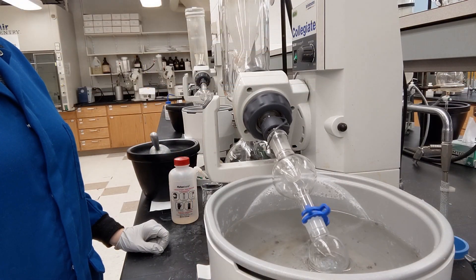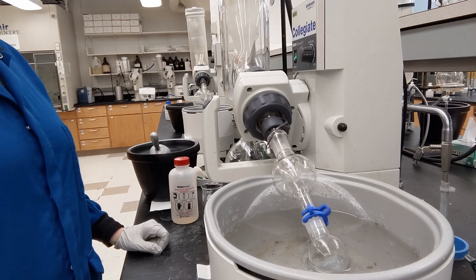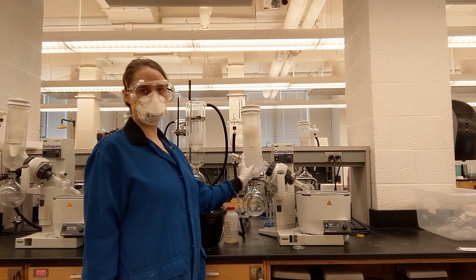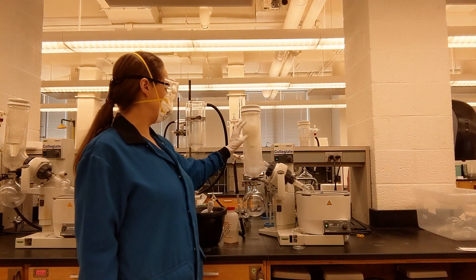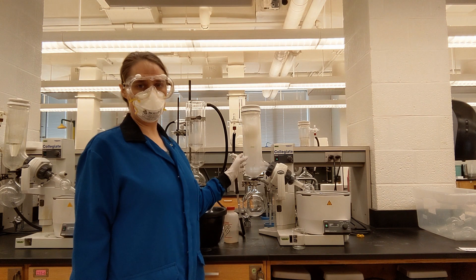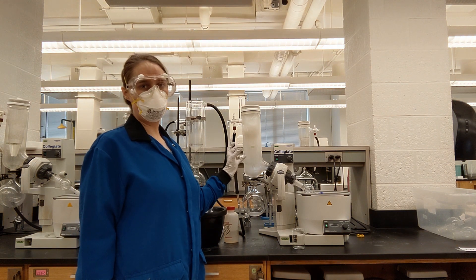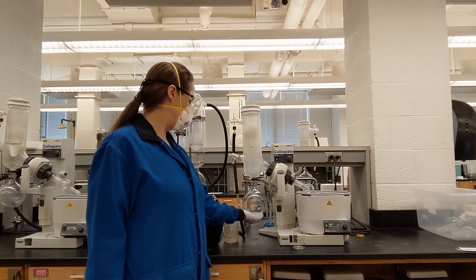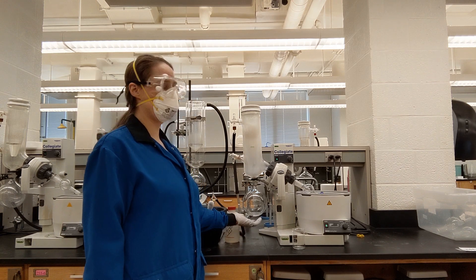At this point in time, my solvent is boiling off very quickly. As it does so, the vapor that's formed is going into this container. Because of the fact that I have the inner tube that's cold, currently at negative 70 degrees Celsius, my solvent is condensing onto that inner tube.